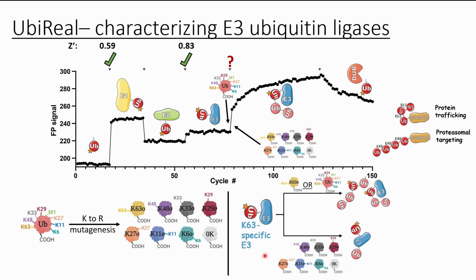But if we fed this same K63 specific E3 ligase the mutant that does have a K63 lysine or wild type ubiquitin itself, we could support an E3 ubiquitin that could write ubiquitin chains, both free ubiquitin chains and larger ubiquitin chains onto itself, again because it's a K63 specific ligase that needs this lysine to make larger chains.